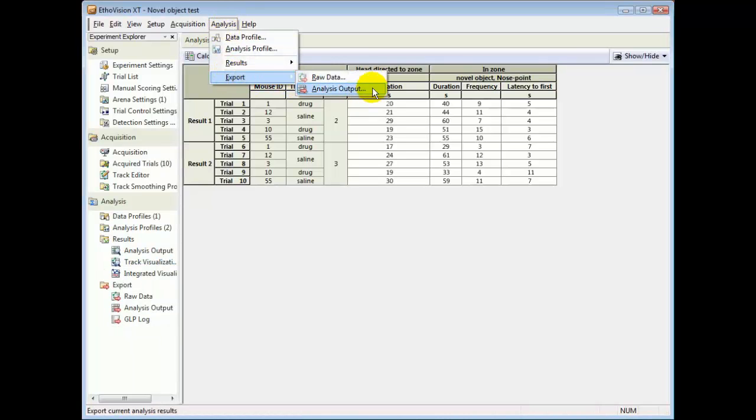And you can also make an export of the raw data, should you want to carry out your own calculations.